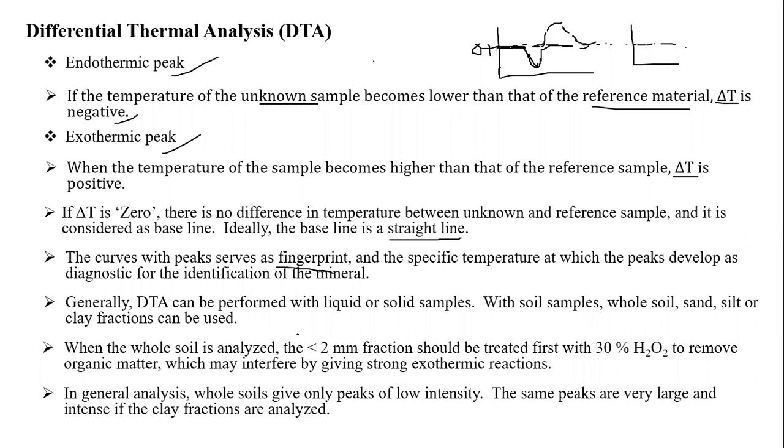Generally, differential thermal analysis can be performed with liquid or solid samples. We can use both liquid and solid samples. When soil samples are used, whole soil, sand, silt, or clay fractions can be used. So we can use any type of sample. We can use the whole soil sample, or take sand separate, silt separate, or even the clay fraction for the differential thermal analysis.